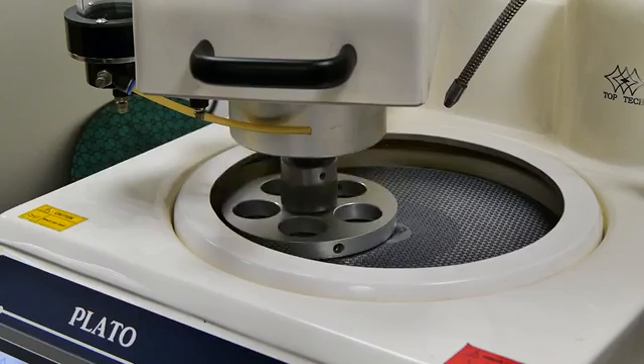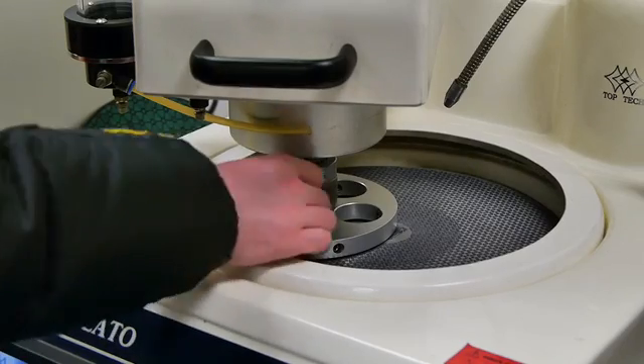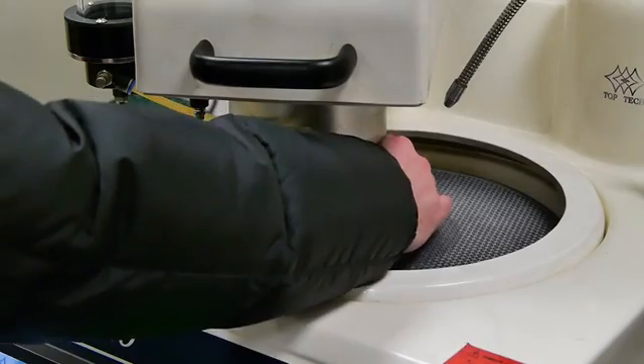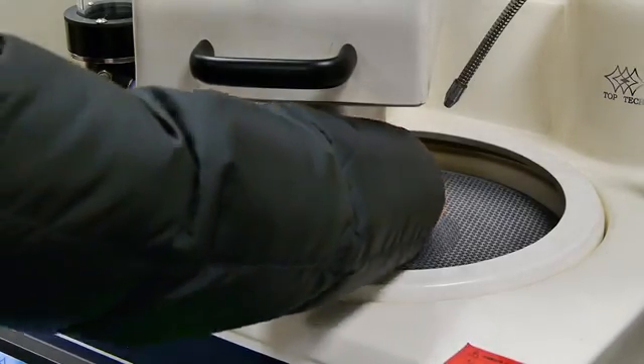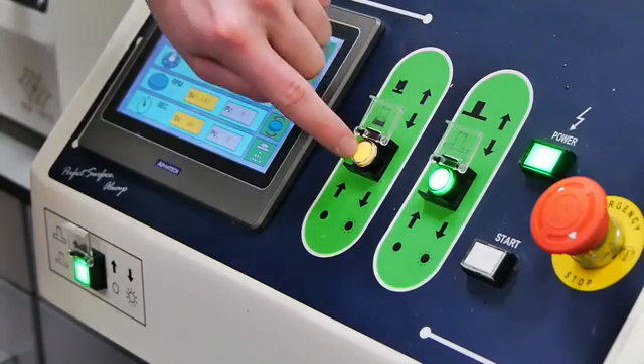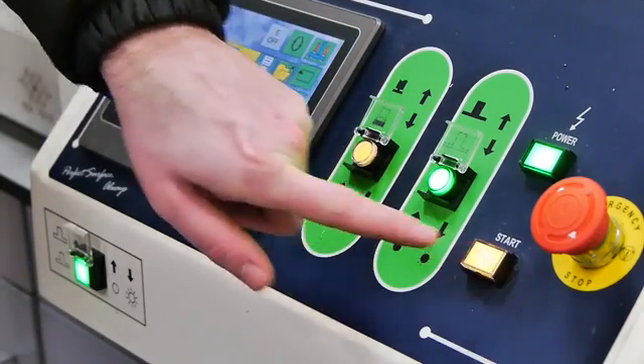We would recommend individually loaded samples rather than central loaded, however this is another option. A second button press applies individual loaded heads, and a single button starts the process.